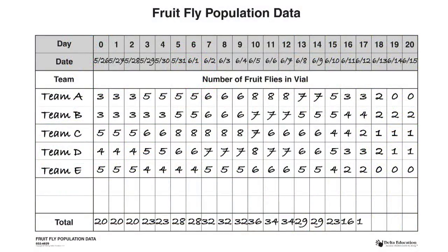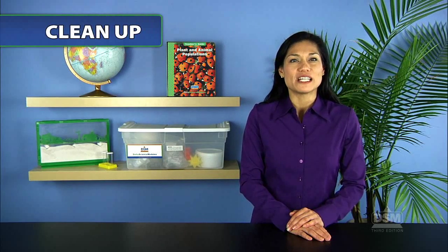Working together, help students add up the total for each observation day on the class chart. Students will discuss their observations in Activity 8. To conclude the activity, collect the magnifiers and return them to the kit. Collect the activity sheets for use in Activity 8.